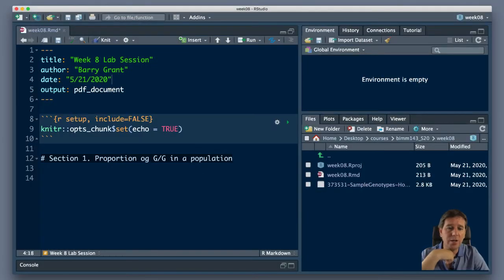The reason I did that is just to keep myself organized, right? I just want to keep my input data along with my analysis script and everything else. So you can see that right here, right? See this 37, very catchy name, but that's the name that we got from Ensembl.